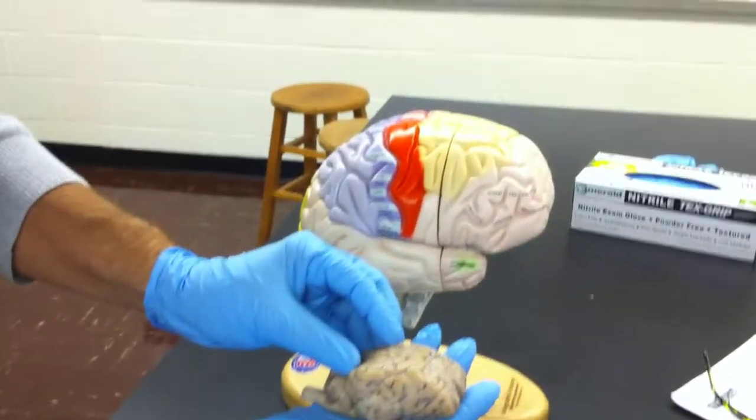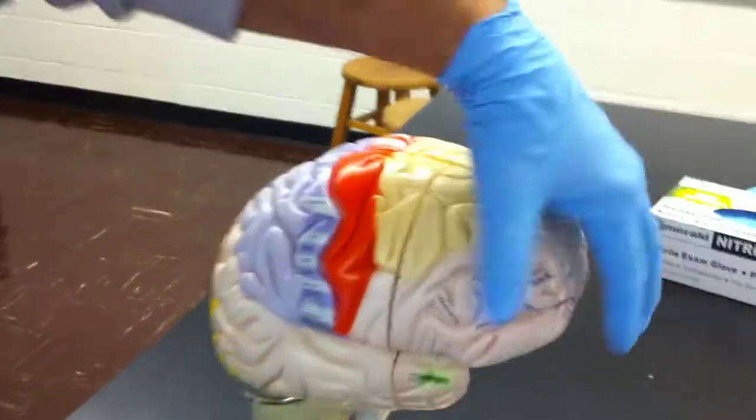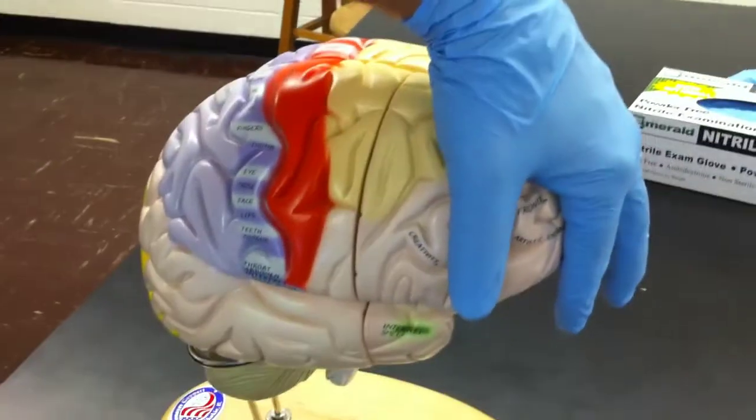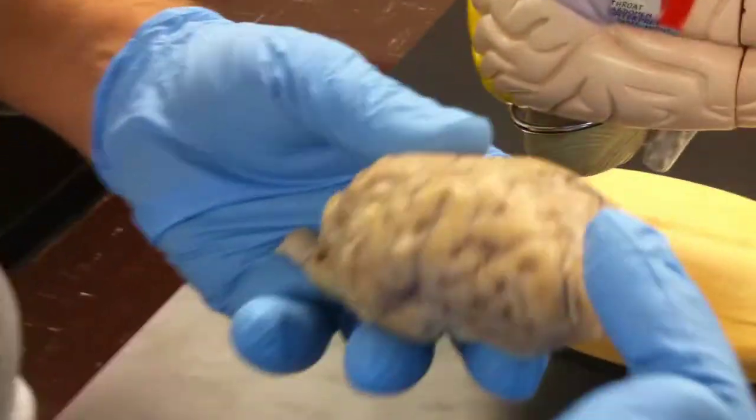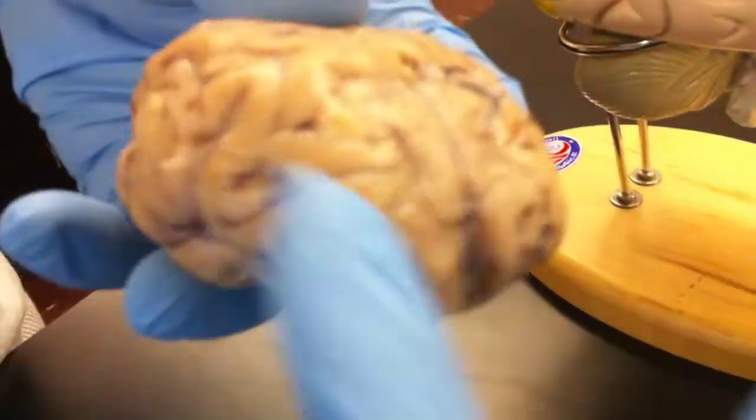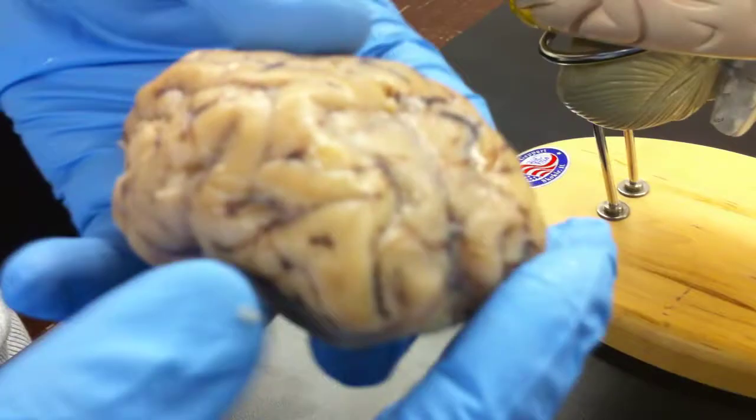Like for example, you can see how big the frontal lobe is. It's essentially where I'm holding my hand here on the human, whereas on the sheep it's just this very small part of tissue in the front of the brain.